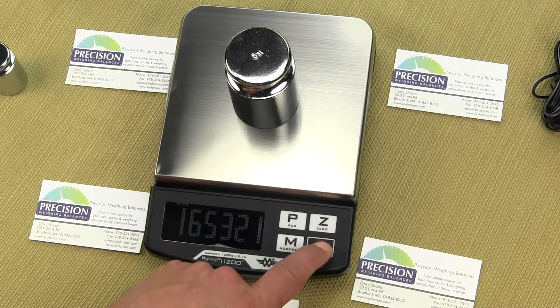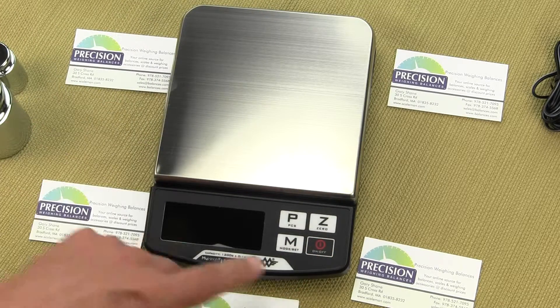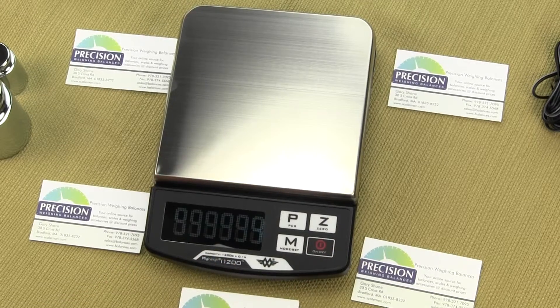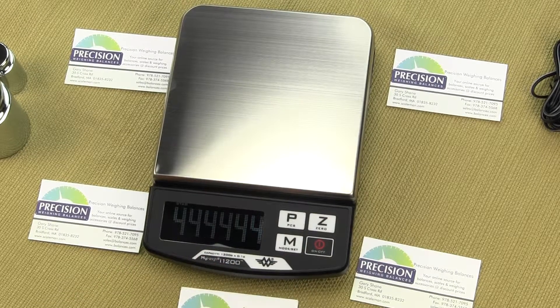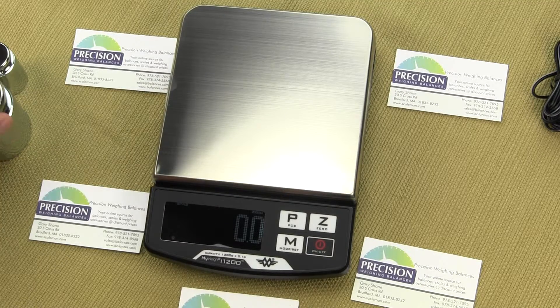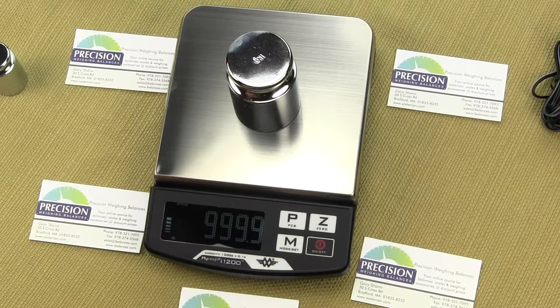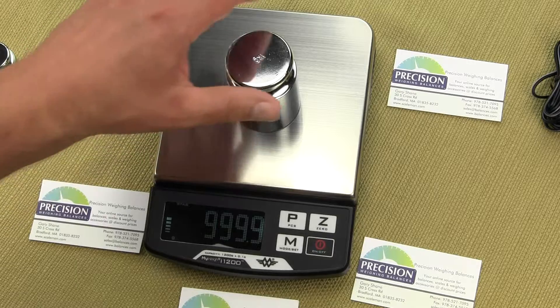Simply shut off the scale, remove the calibration weight, and power up the scale again. The scale has now been calibrated — those new parameters have been stored. If we place our 1000 gram weight on the platform we have 999.9, and since this scale is plus or minus a tenth of a gram, that's within spec.